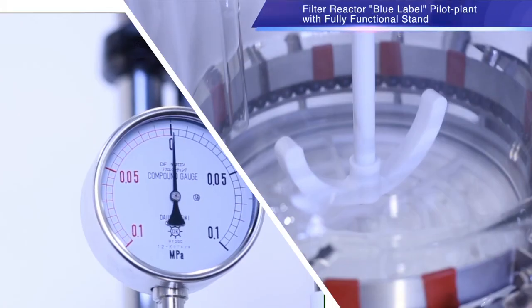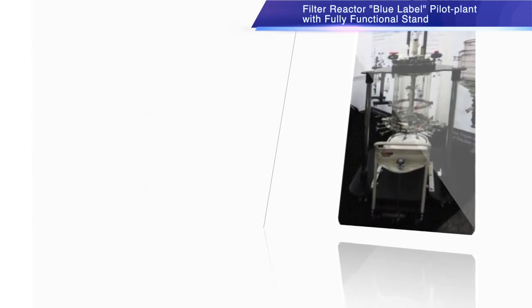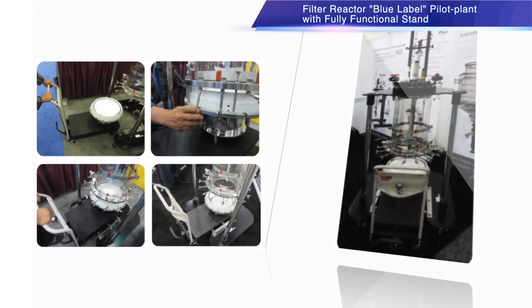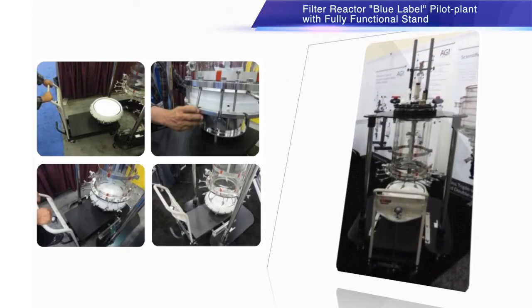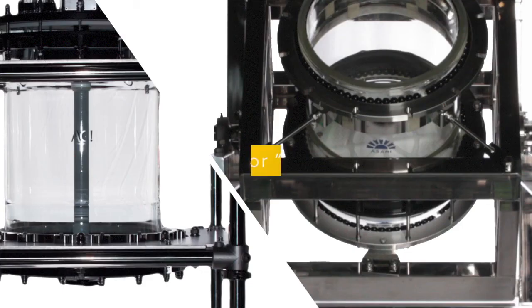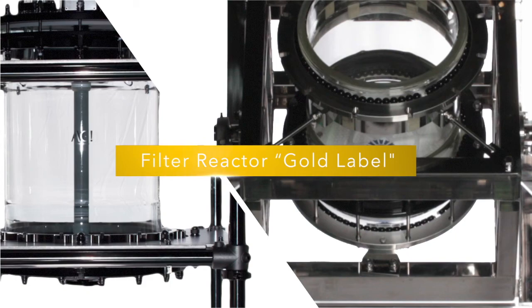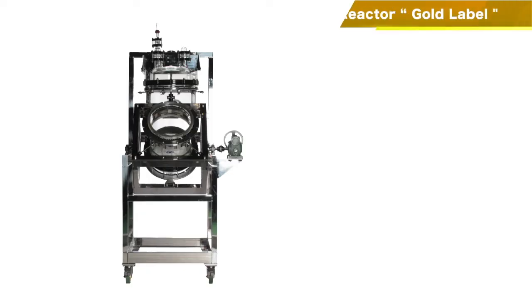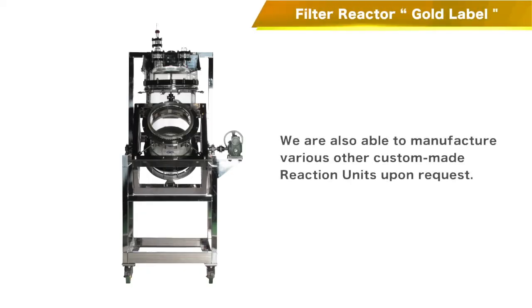Here is the Blue Label Pilot Plant Filter Reactor Unit with stationary stand. Our 50 liter plus capacity units are designed to allow for easy removal of large quantities of powder slurry by using the cart beneath.